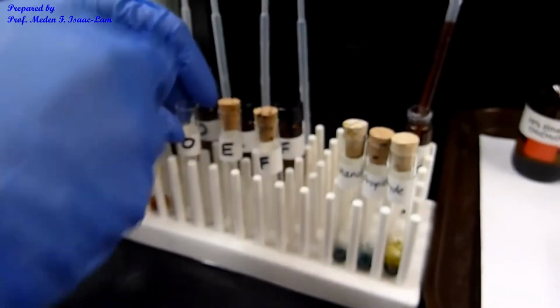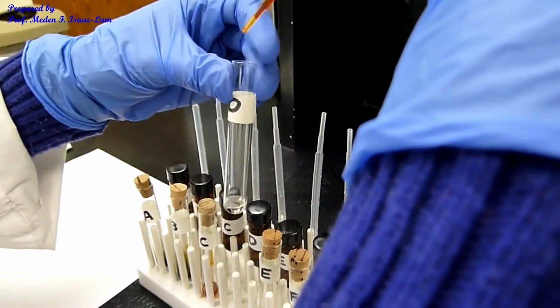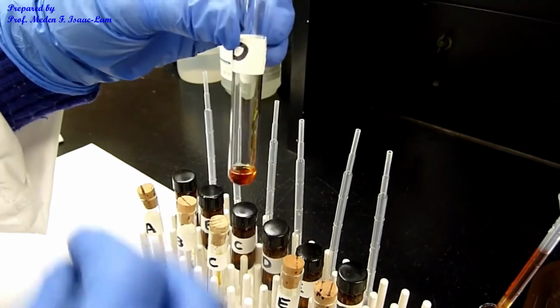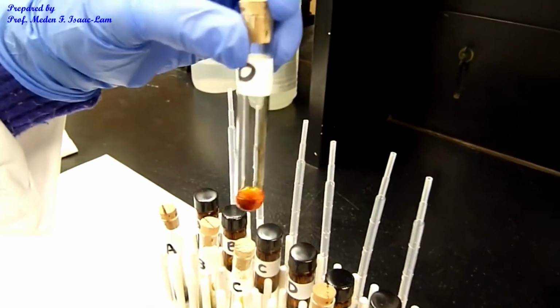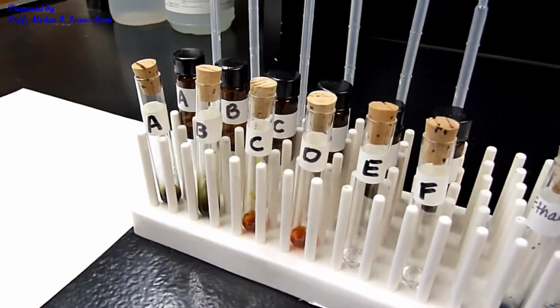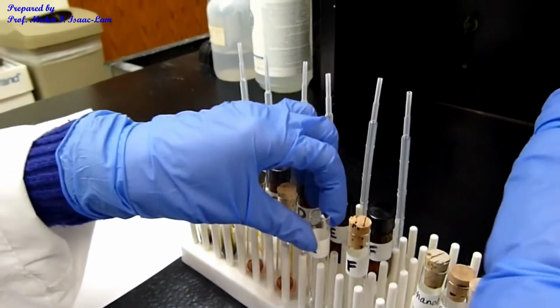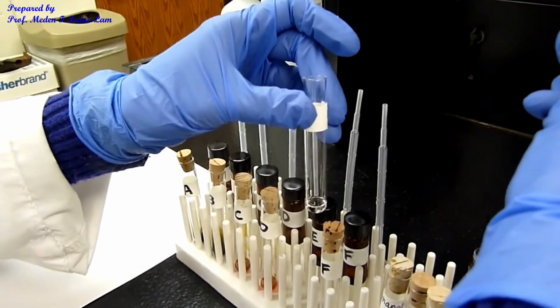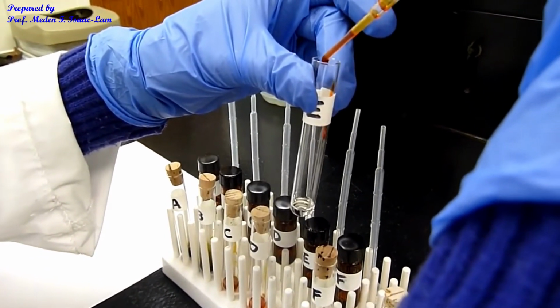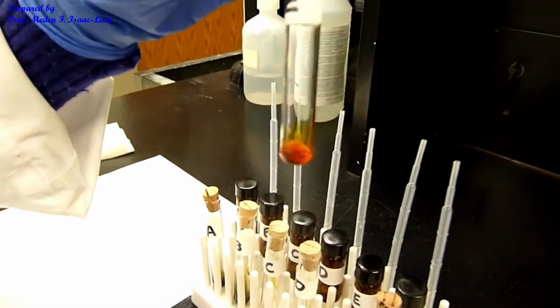Okay, and then we're gonna do D this time. So again, 2 drops. Okay, it's quiet, no popping sound. So same, C and D did not change. And then we're now doing E. So E, 2 drops again. So nothing.